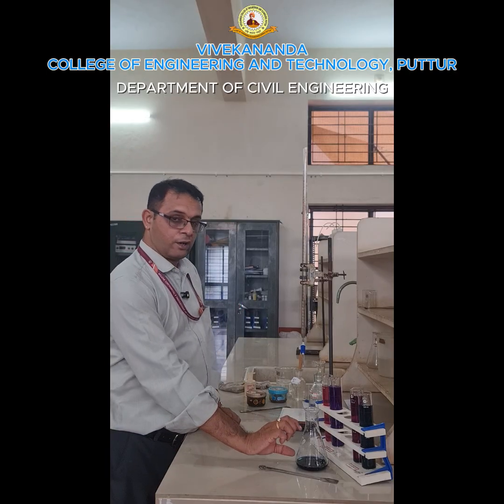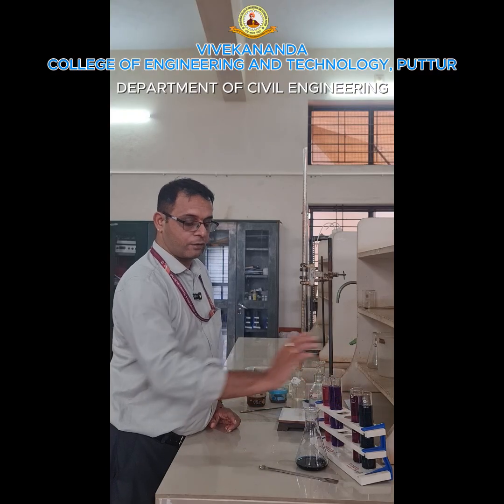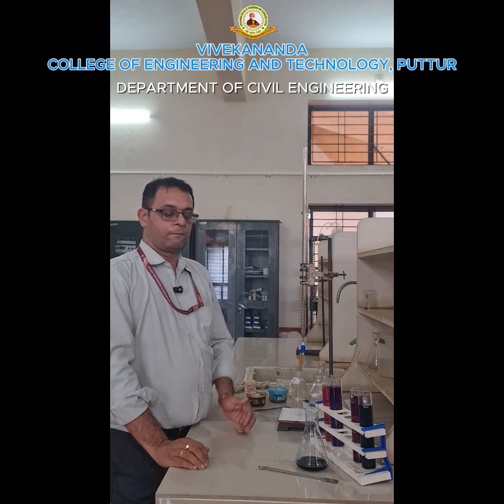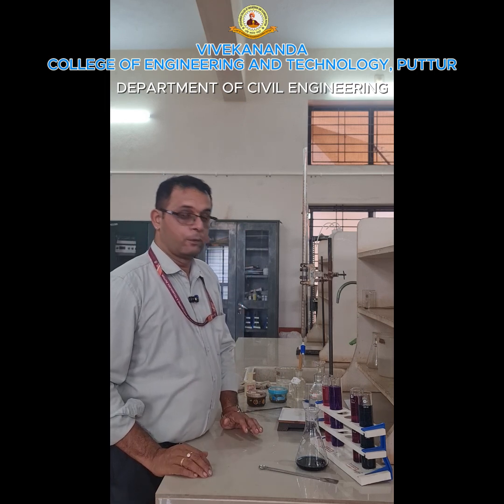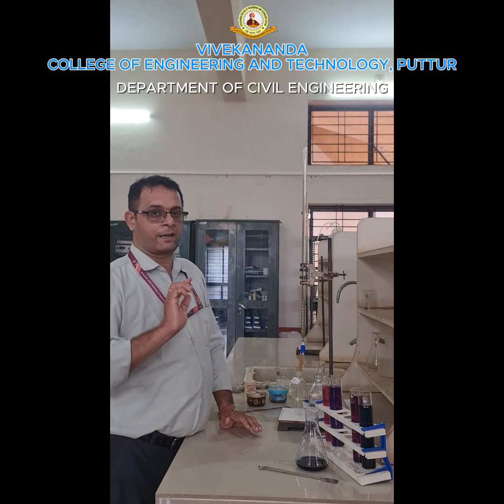So whatever the volume is consumed, if initial is V1 for the first set, for the second set, the boiled and cooled water sample, it will be V2. Similarly, you have to do the 3 trials, get the average of V2. If you substitute that in the formula, you will get the permanent hardness.